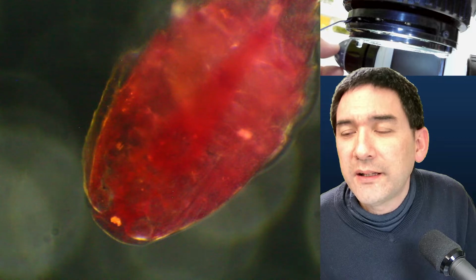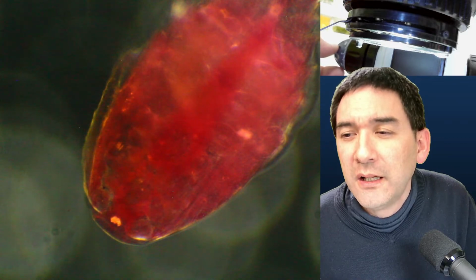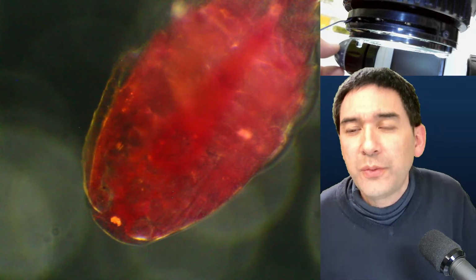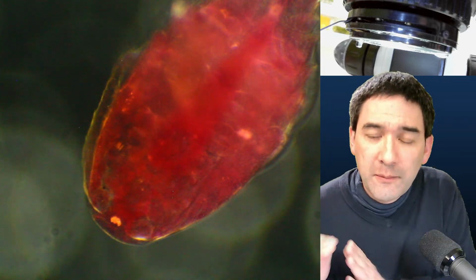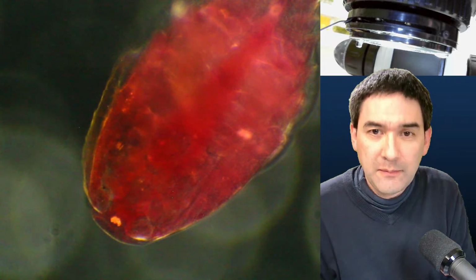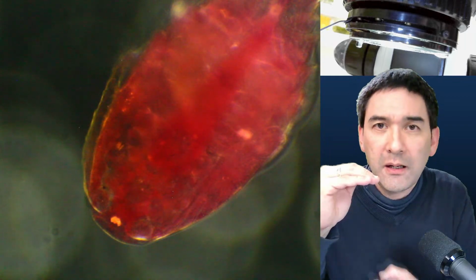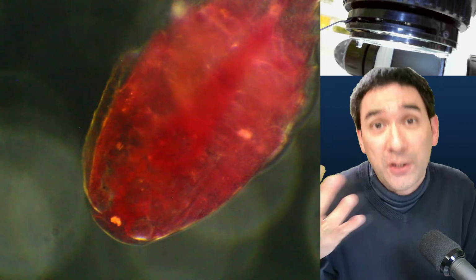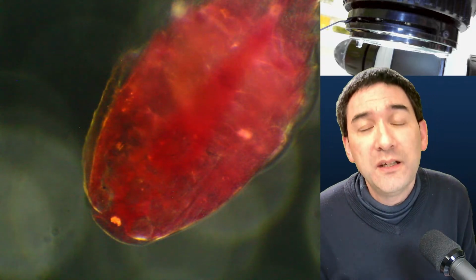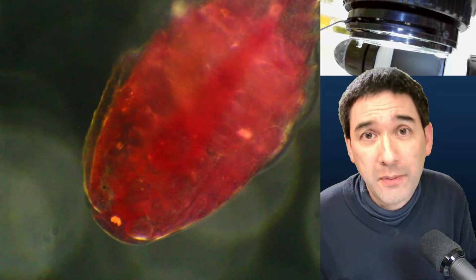Is it correct that the light in oblique contrast hits the sample at a different angle, so that it creates a 3D effect? Yes, in oblique illumination, because I'm decentering the filter, the light only strikes the object from one side, and this creates a shadow, so to say, and this gives the illusion of a certain three-dimensional appearance.